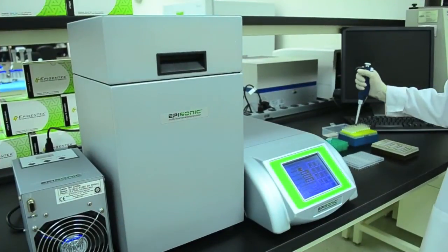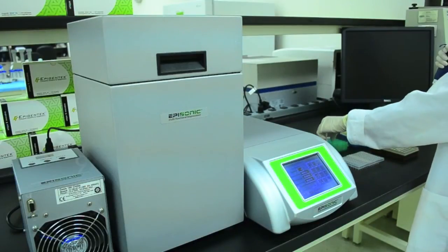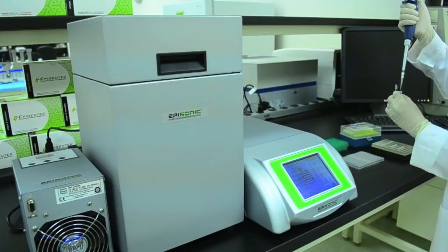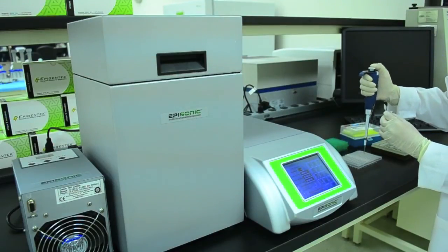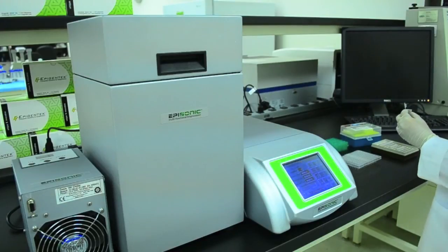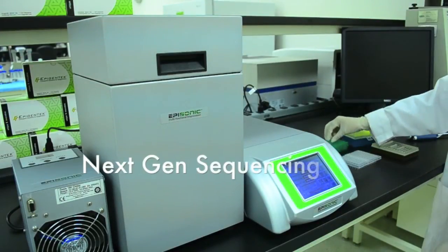The Episonic also offers a plate rack accessory designed for processing samples in standard polypropylene PCR plates. Unlike other sonication instruments, the Episonic enables true high-throughput processing of 96 samples simultaneously. This capability is perfectly compatible with next-generation sequencing technologies.